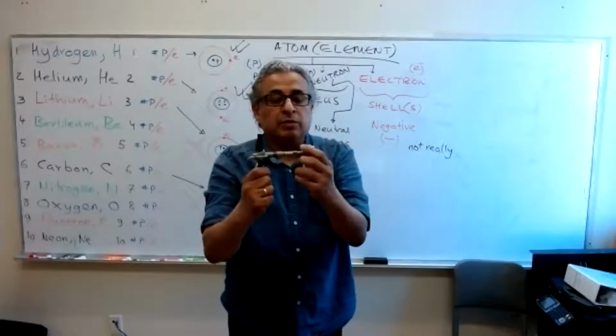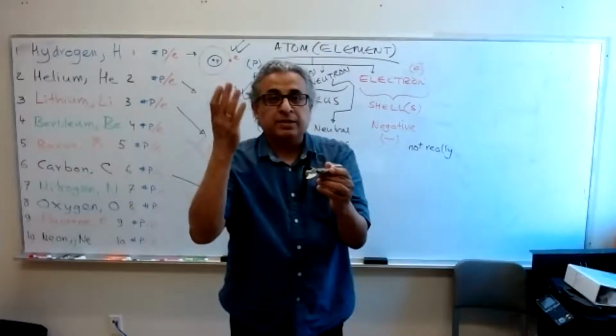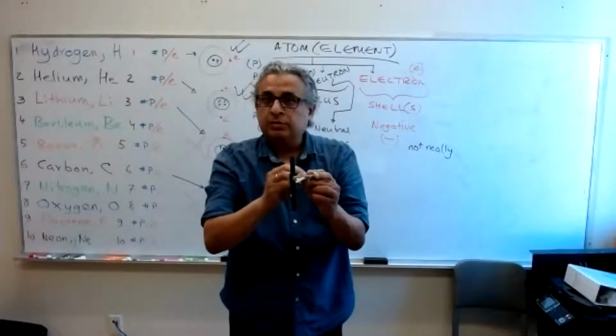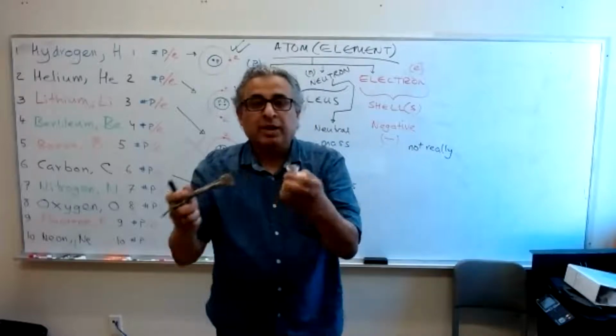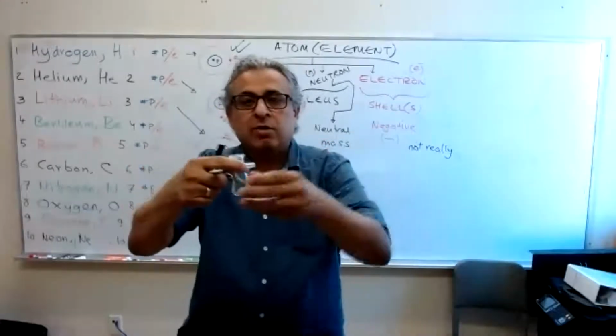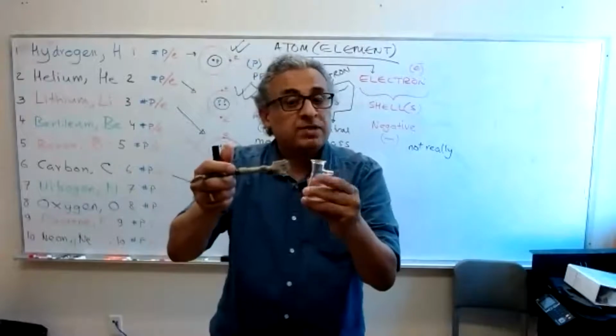It's secure. So being a good chemist doesn't mean that you have to be a PhD guy, a student, or whoever. This is part of safety, actually. If you're just going to be setting it up and putting everything on top of it, then you have a hose, a vacuum hose, this whole thing might topple. That's unsafe. This is part of safety too.